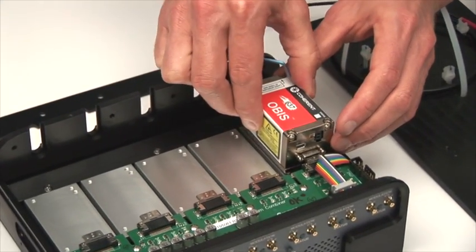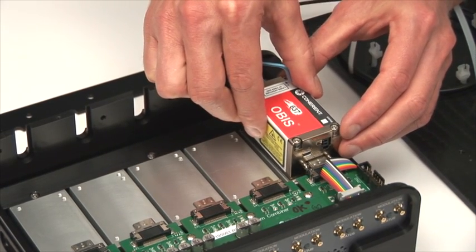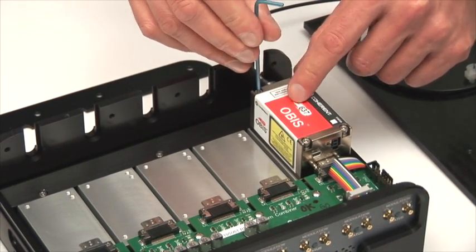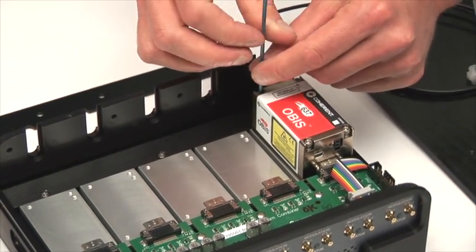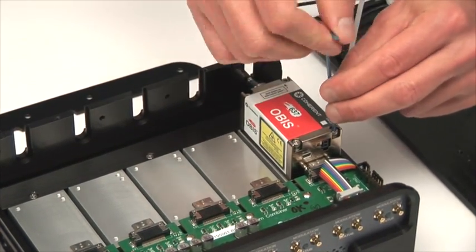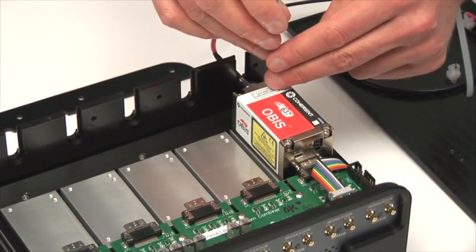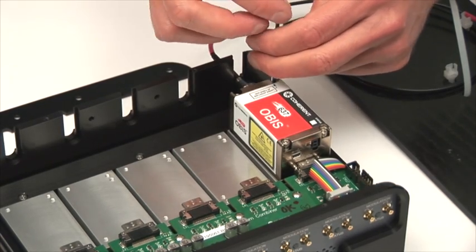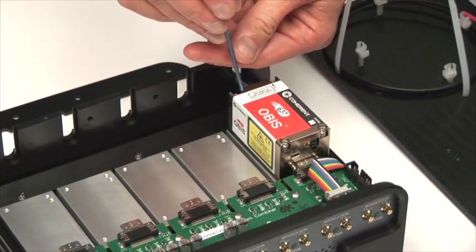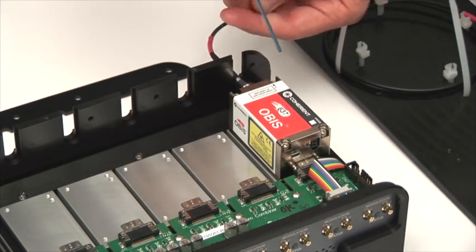Now the laser gets put onto the OBIS heat sink. The SDR connector needs to be connected to the laser, which just slides directly in. Holding the laser and the connector together are the four screws, which also help with heat transfer. When tightening an OBIS laser to a heat sink, always softly tighten the screws — you don't want to torque them down until all four have bottomed out. With all four screws in place, you can do a final snug to get the laser onto the heat sink.